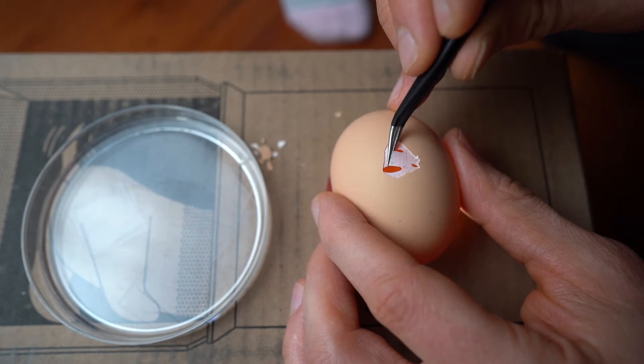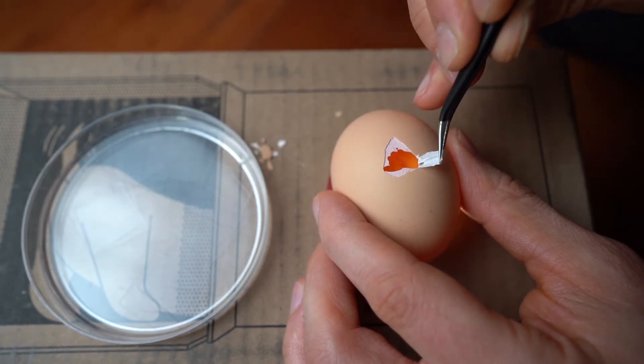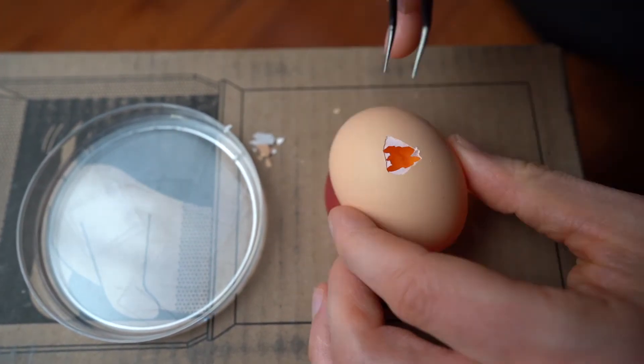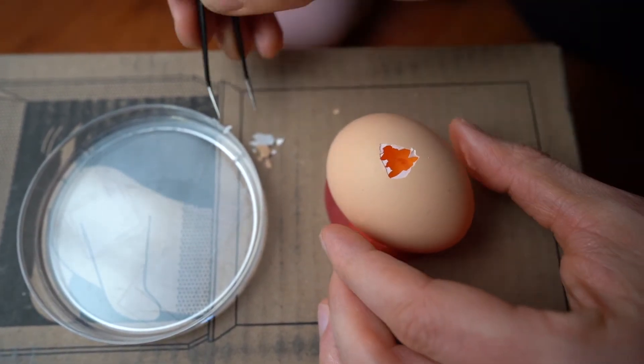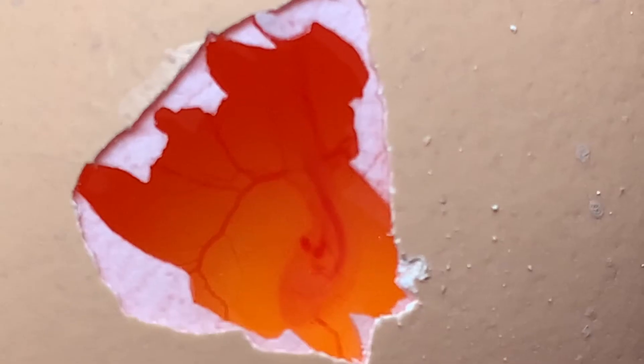Now I'm going to peel back some of that membrane, and if you've done this right there should be an air space between the shell, this membrane, and the little chick that's growing inside. You can see the heartbeat inside here and it's just phenomenal after 72 hours to have so much growth going on inside this egg.